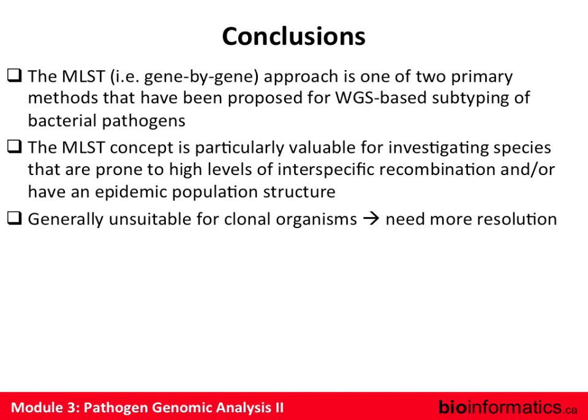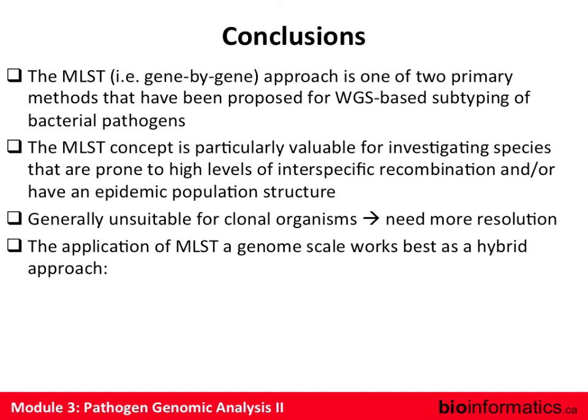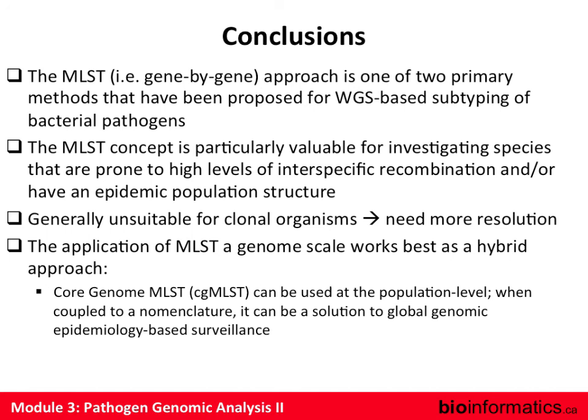I guess the other thing too is, some people are talking about combining MLST, like core MLST, and then having a more whole genome MLST when you need to drill down into an outbreak. Personally, I hate that approach because if you need to delve into an outbreak, there are better tools like SNV analysis that are far superior to doing MLST analysis. So I don't advocate the hybrid approach. Use the tool for what it's good for. So MLST, to me, is for long-term population tracking; once you've got an outbreak investigation, you probably want to use SNV analysis.